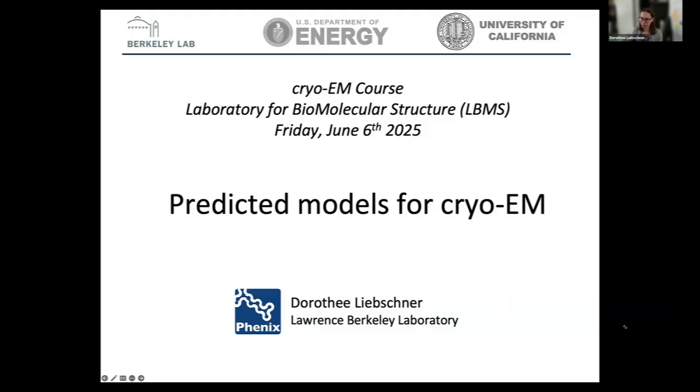In the next 50 minutes or so, I will be talking about AlphaFold-predicted models for cryo-EM. So it's more from a practical point of view. I work in the Phenix group, so there will be, here and there, some practical tips or screenshots of the Phenix software, showing how you can do certain things. And I will share my slides.